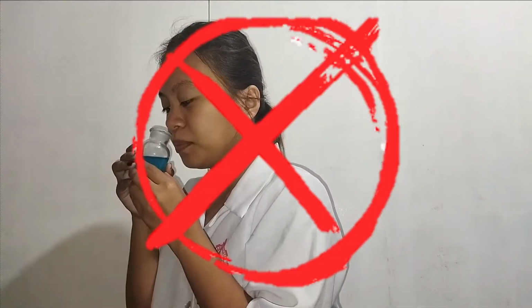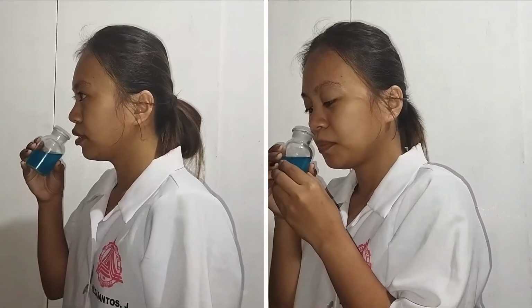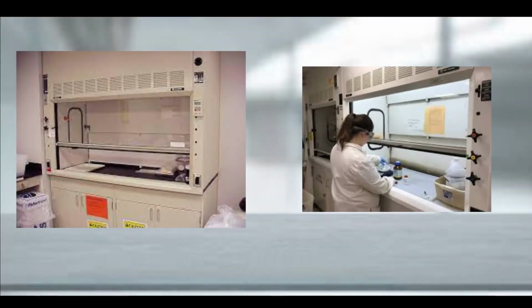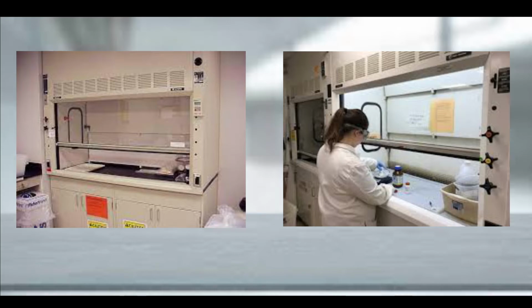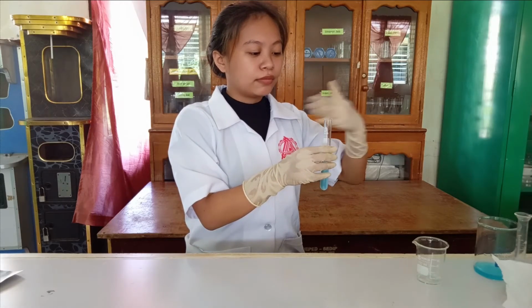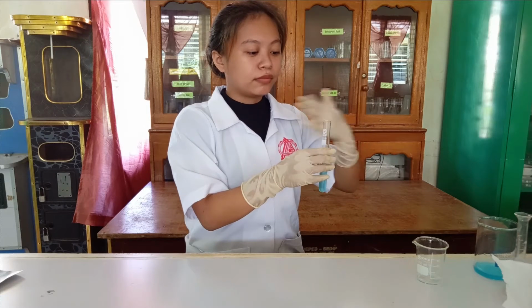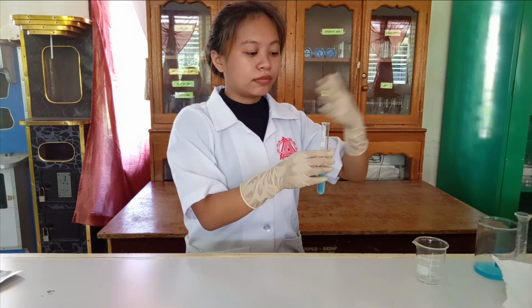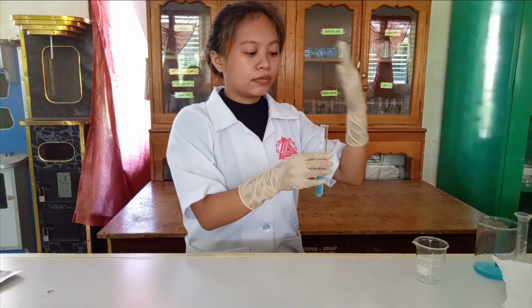Testing for the odor and taste of chemicals. Chemicals should not be tasted nor tested for odor unless specifically directed to do so. Working with toxic vapors must be done in a ventilating hood. To test the odor of the substance, waft a bit of vapor towards the nose as shown. Do not inhale the vapor directly from the test tube. Never hold your face directly over vapors.